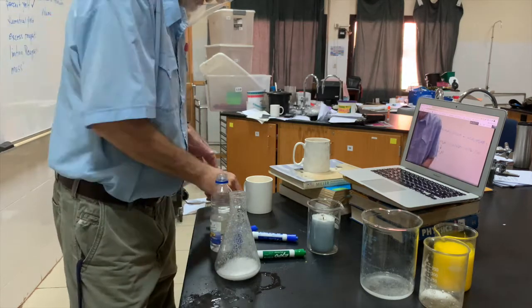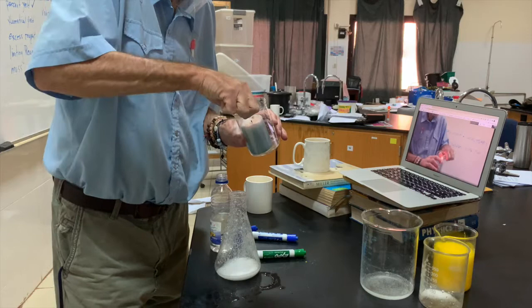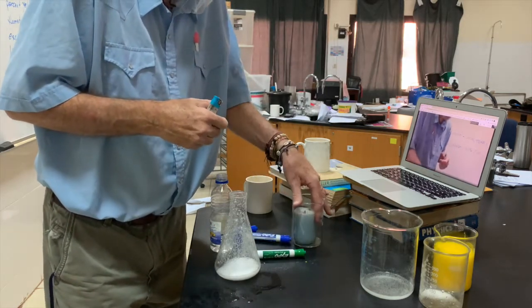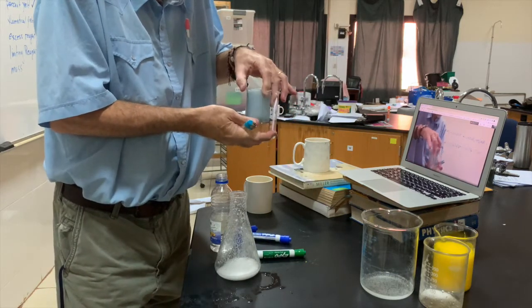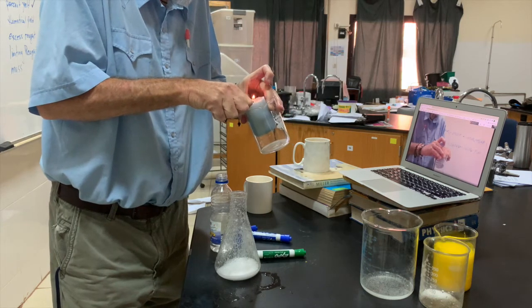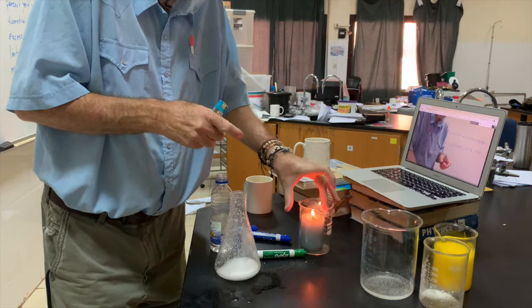Let me light this. I need a splint, but yeah, it smells like. Don't burn your okay.